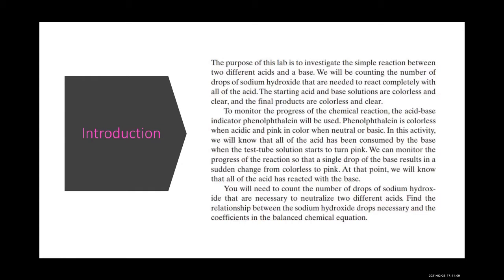In this activity, we will know that all of the acid has been consumed by the base when the test tube solution starts to turn pink. We can monitor the progress of the reaction so that a single drop of the base results in a sudden change from colorless to pink. At that point, we will know that all of the acid has reacted with the base.